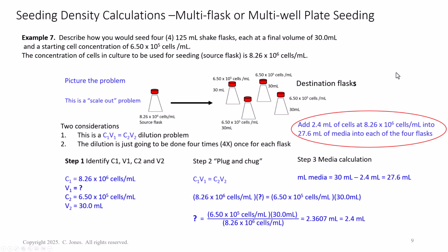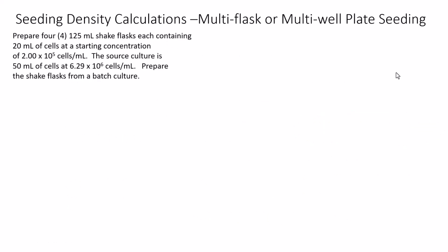Okay? All right. So one challenge with that is we're having to open and close these flasks multiple times. If we have good aseptic technique inside the BSC, this should be okay, but this is one way to do it. Another way to do it is to do this from a batch culture.